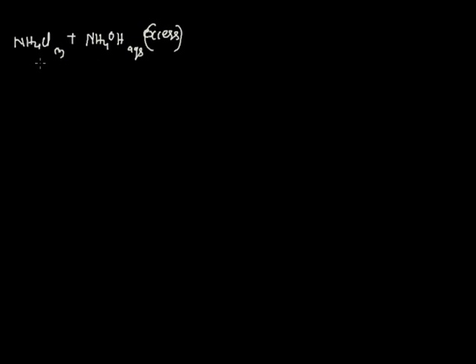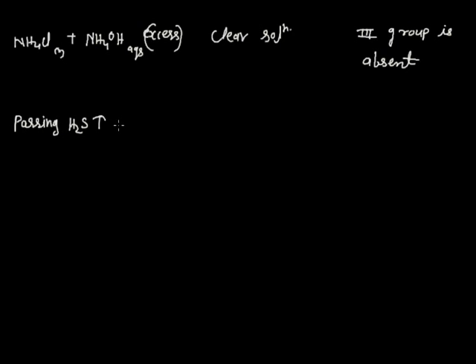Here again there is a clear solution, which indicates that the third group is absent in this salt. In the next step, we pass H2S gas through the above test tube.